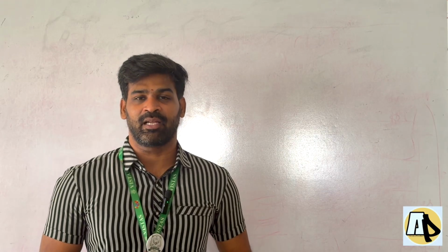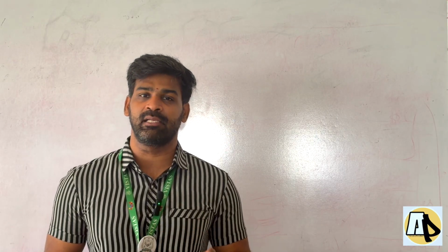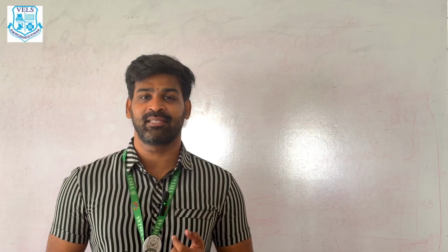Hi students, welcome to A&P Science and Pharma. Today we are going to see a practical session of how salicylic acid is synthesized from methyl salicylate.